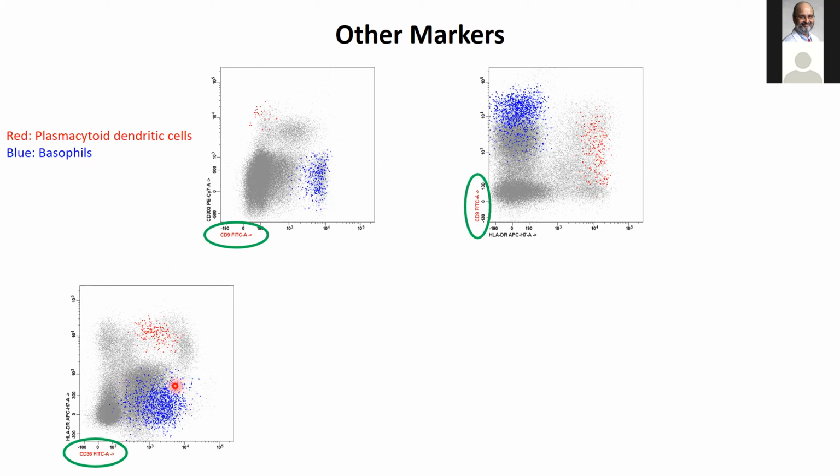And in this case, you can see this big blob of gray back here. These actually are neutrophils. They ought to be sitting over here, and they're showing staining for CD36. So this case here did in fact have platelet adherence to our cell populations.